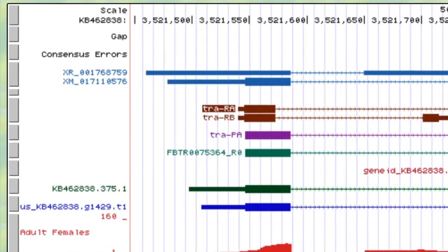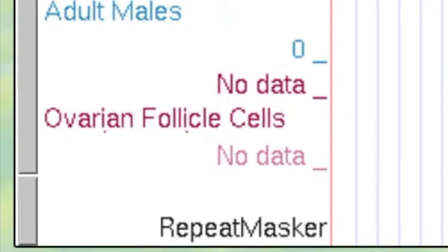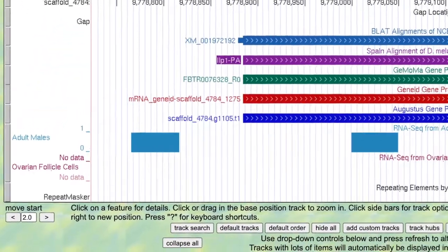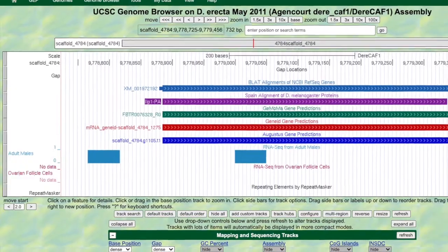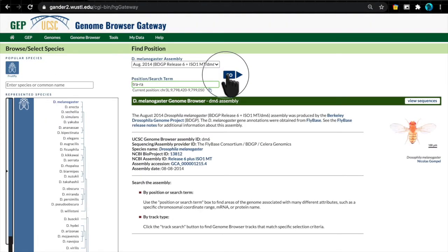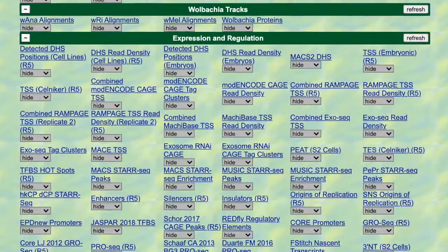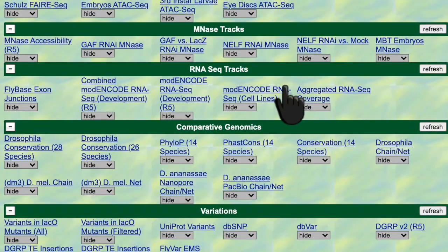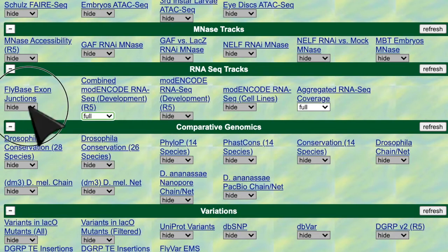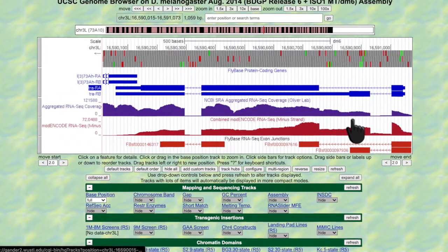You may be given just adult females, adult males, only mixed embryos, or maybe your RNA-seq data is just such low quality that it's inconclusive. Whatever it is, if you're lacking supporting data in your target assembly, you may want to try referring to Dmel's assembly for the track of interest — in this case RNA-seq — that we can use as a reference to guide our annotation for our target species.